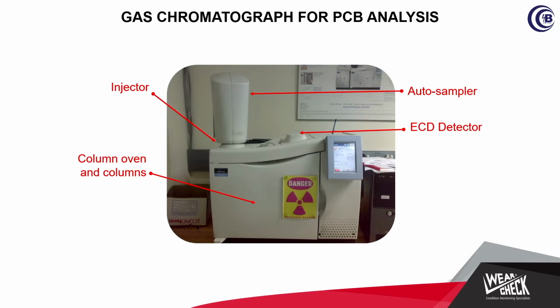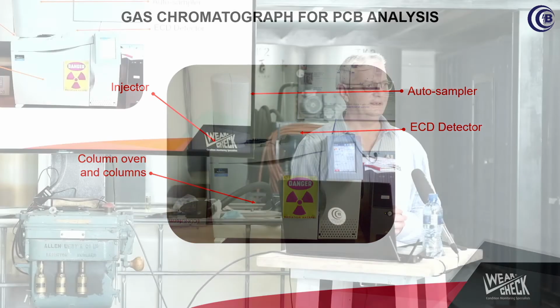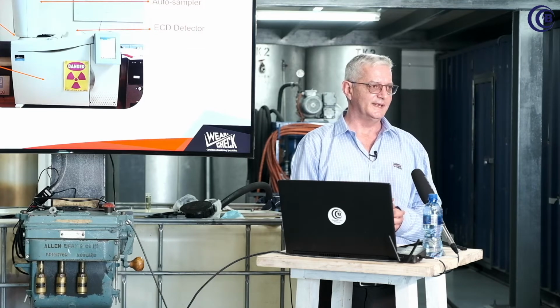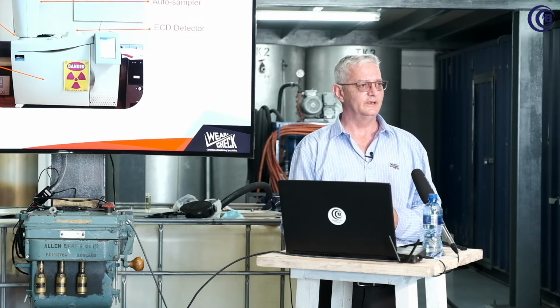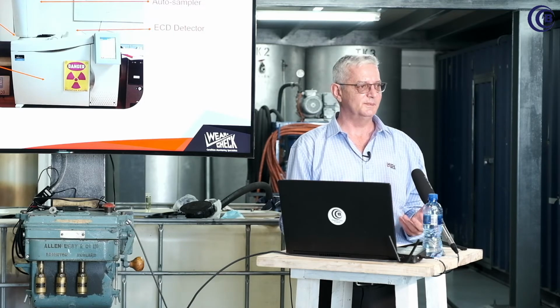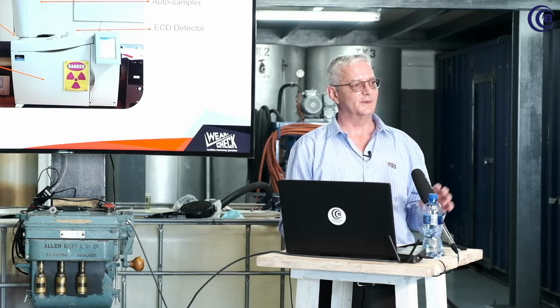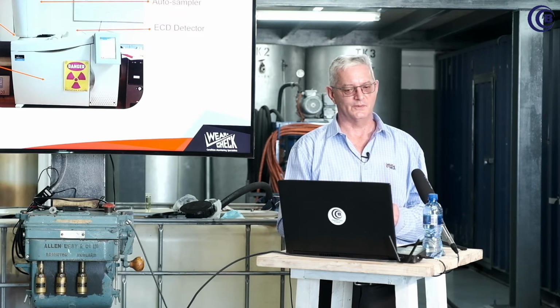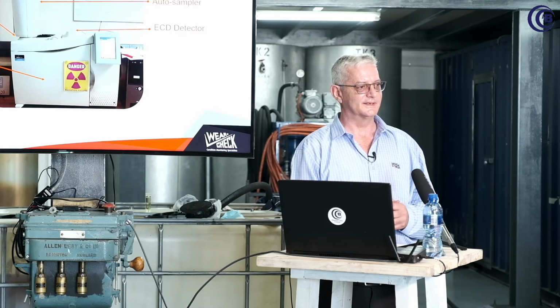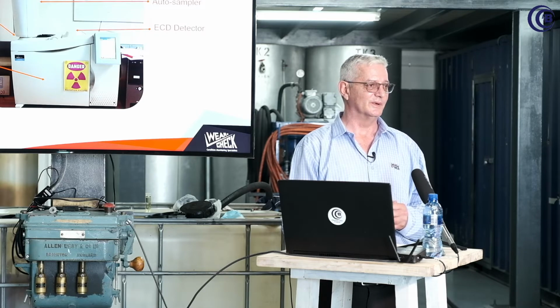Difficult test to do, difficult test to interpret. Where you will have one peak for hydrogen, for example, or acetylene, which is easy to integrate. We are looking at 3 Aroclors when we test PCB: Aroclor 1242, 1254 and 1260. Those were the names when PCB oil was sold. Now we refer to it just as PCB, polychlorinated biphenyls, but it contains 3 different Aroclors that we are testing for. But each Aroclor, you're looking at about 50 different peaks, which makes up your sample.